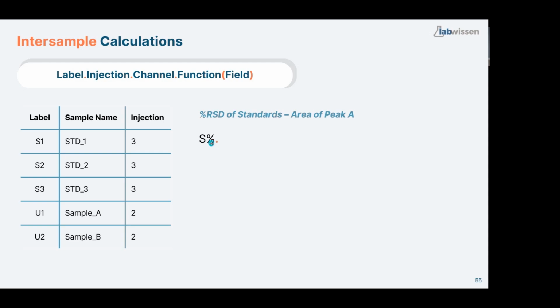Percent is a placeholder. That means it takes all S's. And I hope you know what I mean. It takes all S. Then I put dot. Dots are really important here.